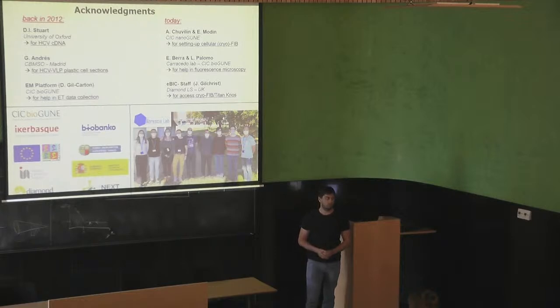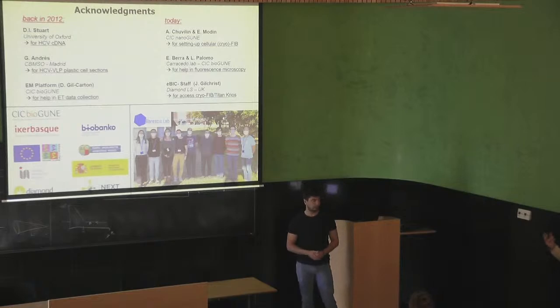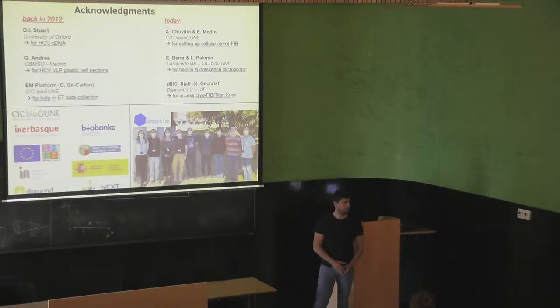Yeah. So maybe a bit more physics into that. The xenon is heavier, so at the same energy it is slower, so the damage is less. But the removal rate efficiency is the same or better, so you get all the benefits. The better would be to go even deeper in weight, but then it will be too expensive. Right. Thank you. You're welcome.